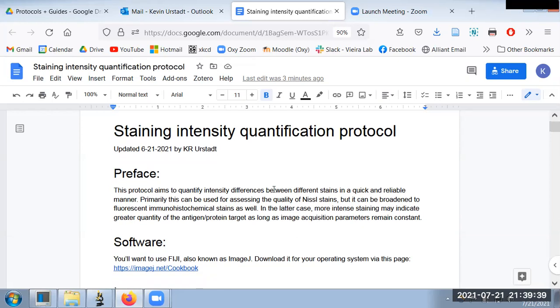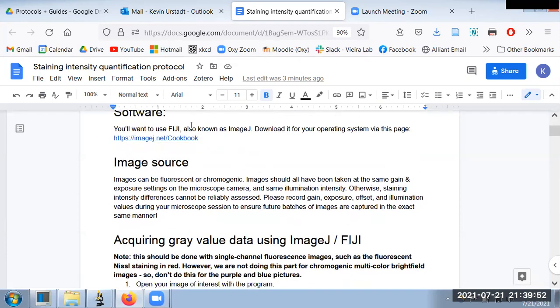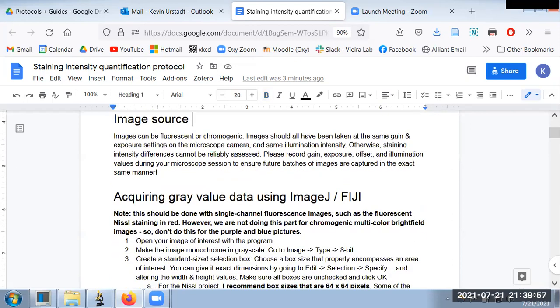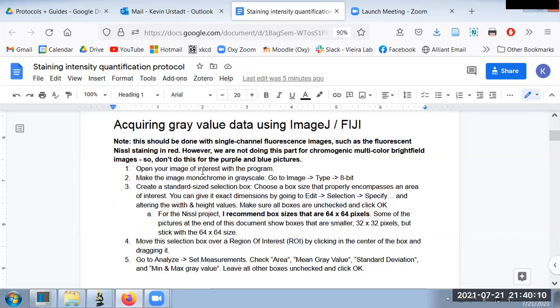With that brief intro out of the way, I'll briefly show the protocol for anybody who wants to copy it down. We have one initial page describing the purpose and the software being used — we're going to be using Fiji, also known as ImageJ. The image sources, depending on what you're trying to do, can be fluorescent or chromogenic, or just stained images of tissue. This protocol covers doing it with a single-channel fluorescence image converted to grayscale.